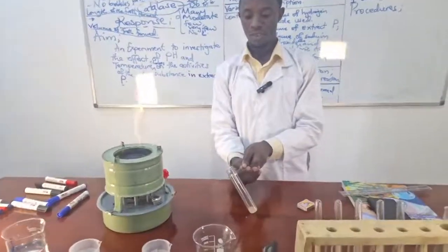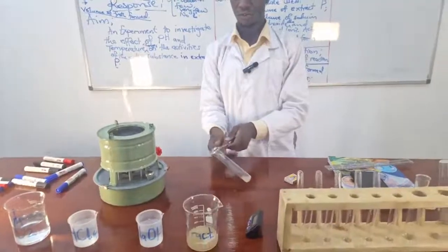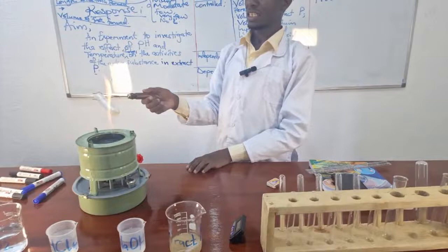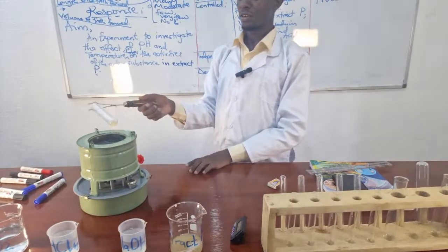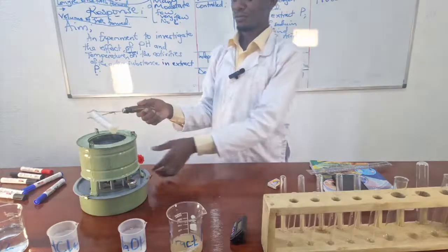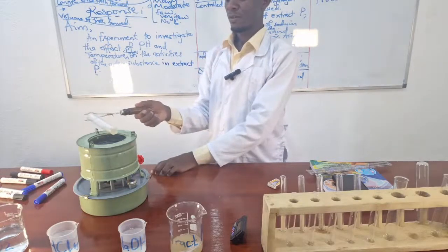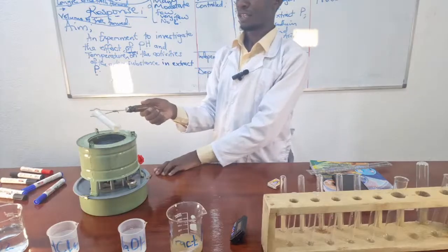Make sure that the test tube or boiling tube is firmly held by the holder. Slant it slightly. Don't point it to your neighbor or to yourself. Don't hit it on the surface of the heat source.